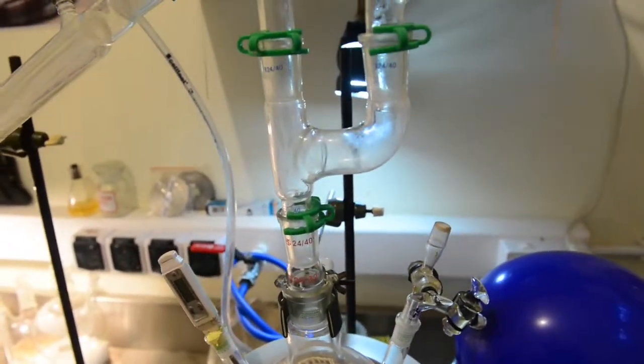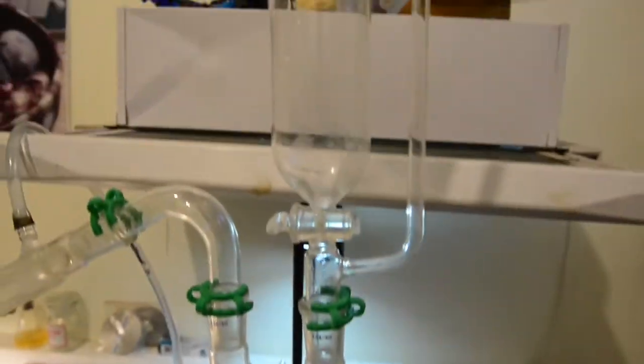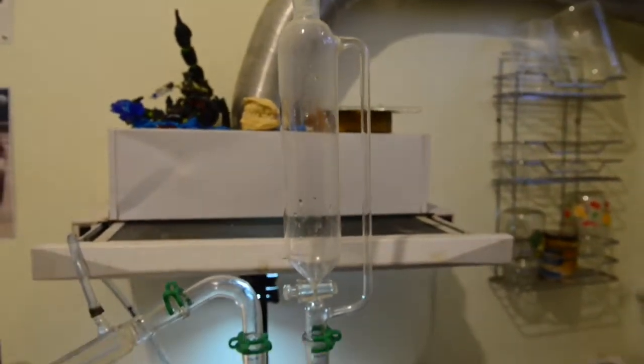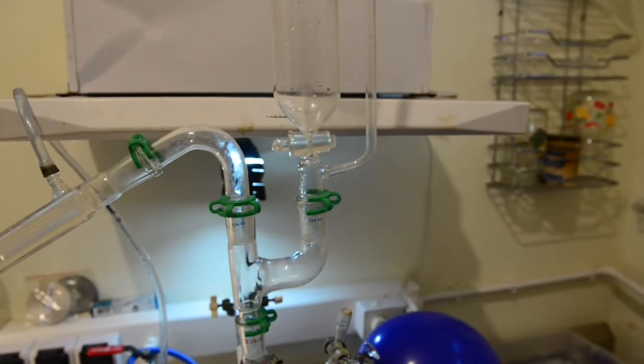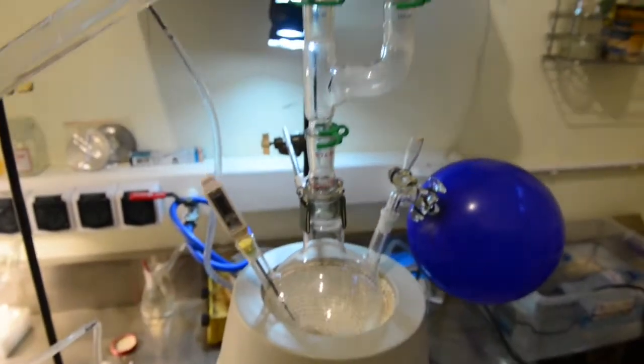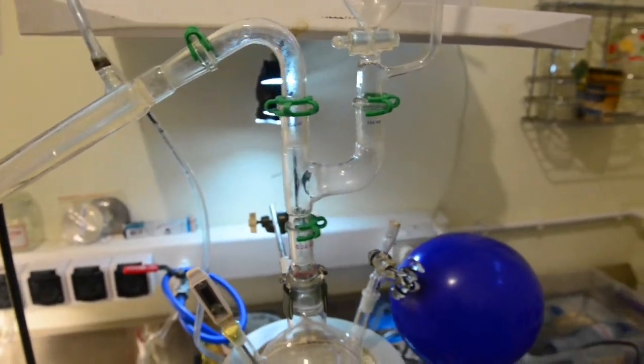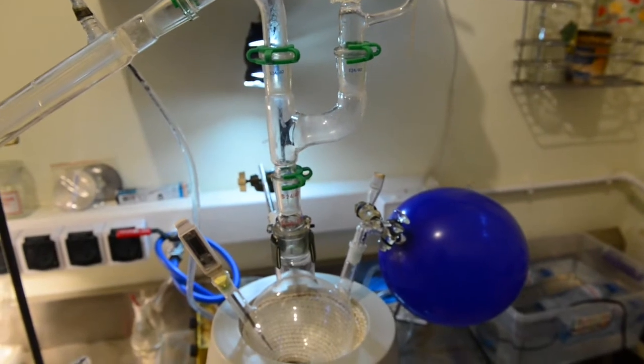We need a strong heating source, like heating mantle and we need to reach 235 degrees Celsius. As you can see, we have attached pressure equalized addition funnel, because we have to add portions of formic acid later on. The system must remain sealed from the atmospheric oxygen all the time.